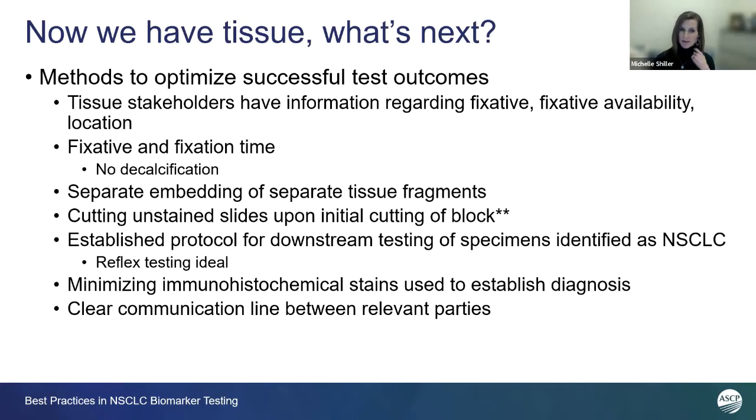And maybe even where a second container would be, should it be a busy night in the OR when there's no one there, and the normal fixative that's more readily available is not full.